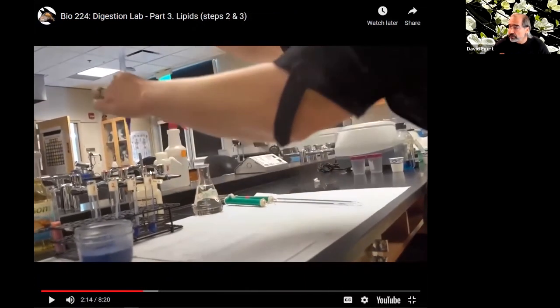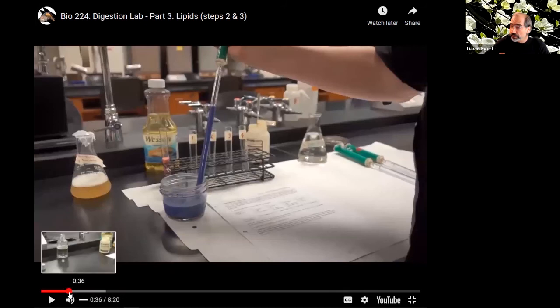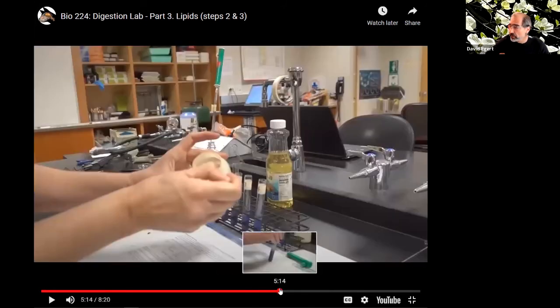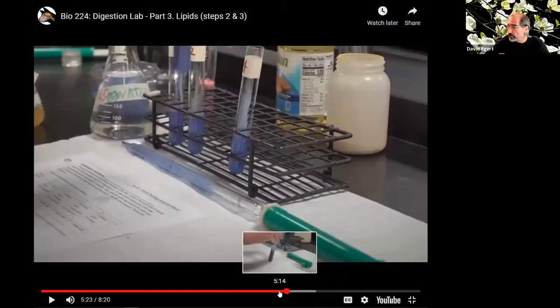There we go. Right, she's adding in the litmus cream. This is just cream that has been mixed with this litmus powder to make it blue.